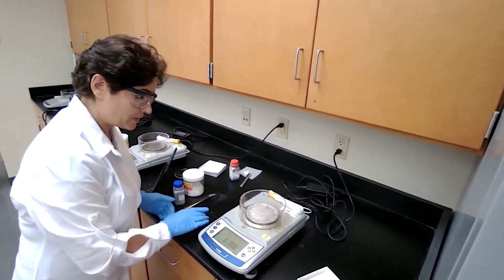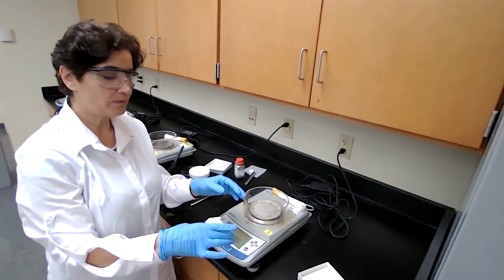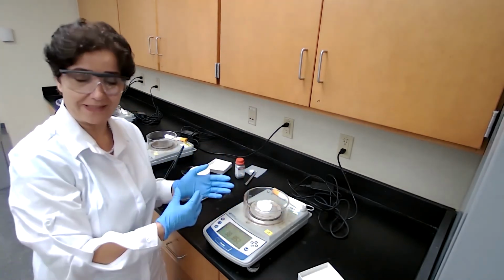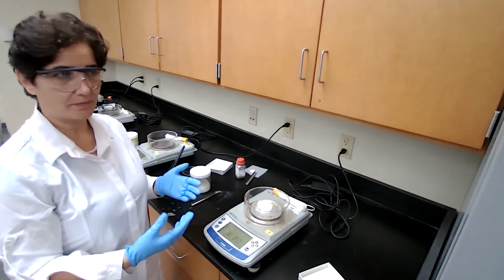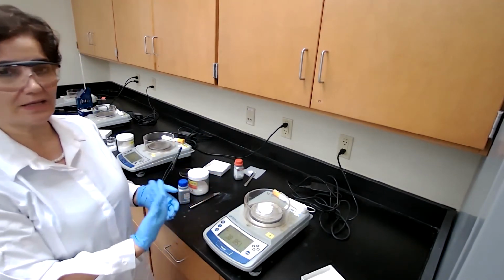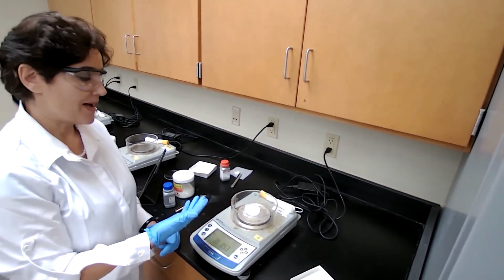Okay, we are going to measure the mass. The object has reached room temperature. The best scenario would be, if you have a hot object, you place it in a desiccator that doesn't have any moisture to be absorbed by the object, so when you measure it, it's actually a dry object. And if we don't have a readily available desiccator to use every day in the lab, we at least have to be consistent at the temperature that we are measuring the mass.